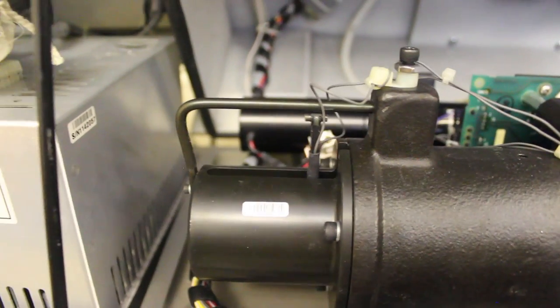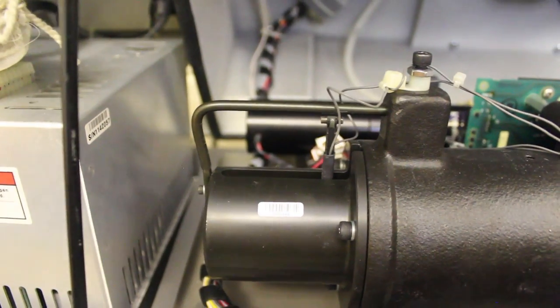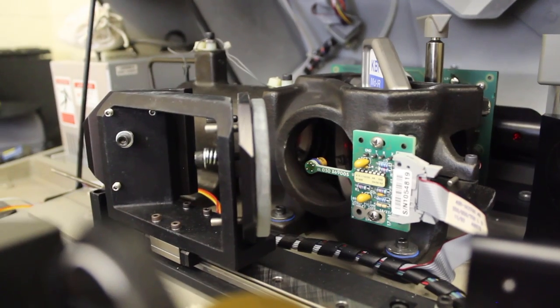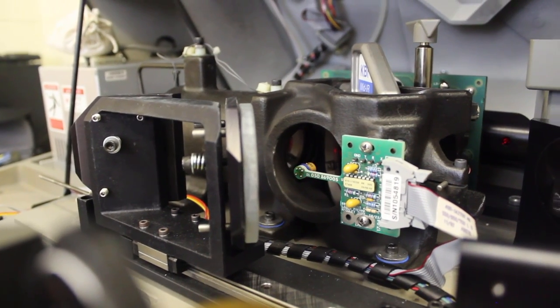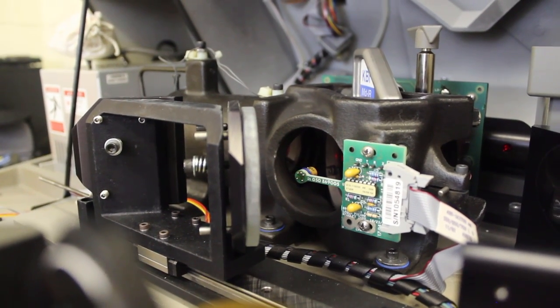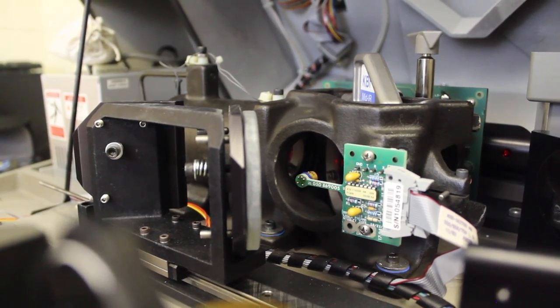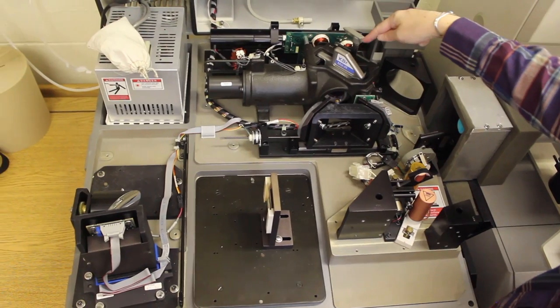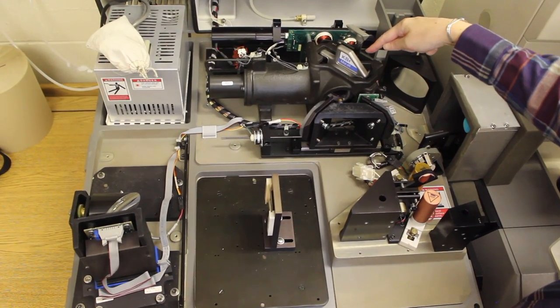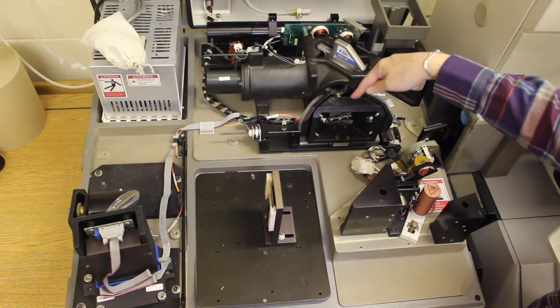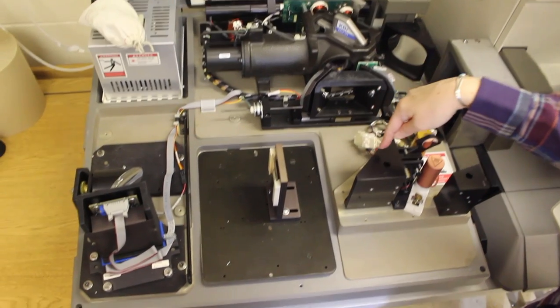The interferometer splits the beam in half with a beam splitter and sends it to a moving mirror and a stationary mirror. The light bounces off both mirrors, combines, and exits the interferometer.